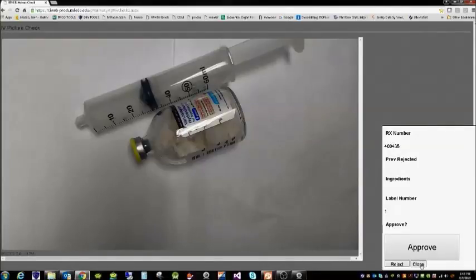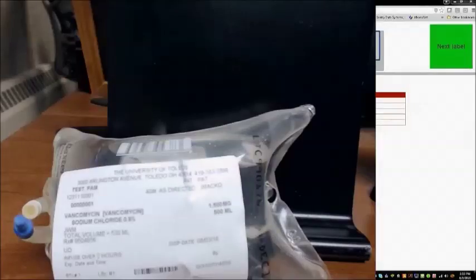And that's what the pharmacist does when it comes out of the box, out of the IV room, to the pharmacist to check. After the pharmacist is done checking all the bags that were admixed, you will take those and put them in the refrigerator. From there, they'll either be used for a specific patient or they'll go up into the operating room AccuDose, depending on the dose. When they are used for a specific patient, in this case, we've got Pam Test getting a 1500 milligram dose. You'll pull the bag out of the refrigerator so it'll be nice and frosty.